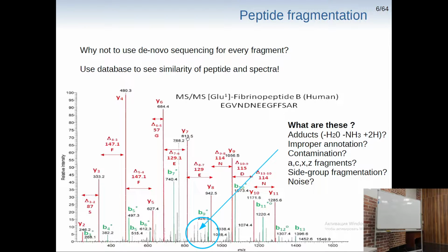So in these cases, when we want to specify our sequence, we turn to nucleic genomic databases. And only after you get those proteins and those mass spectra, and you have not just annotation but positive identification of different peptides which are present here, you can actually convert it into a protein database, and nowadays it's manually curated and it can go to SwissProt.